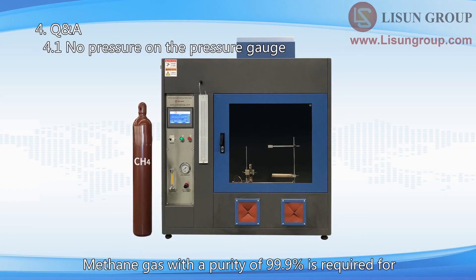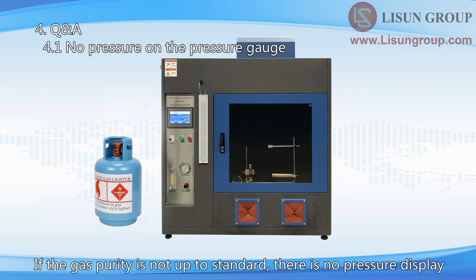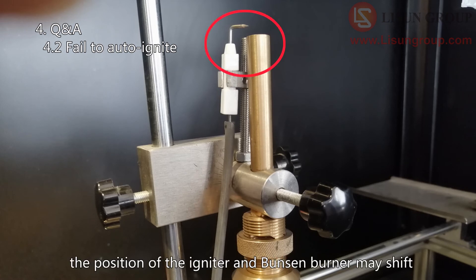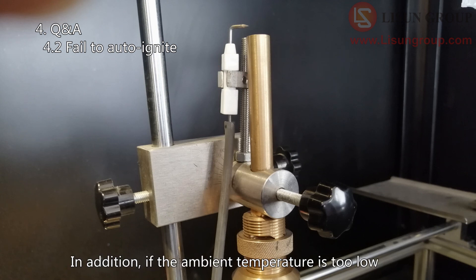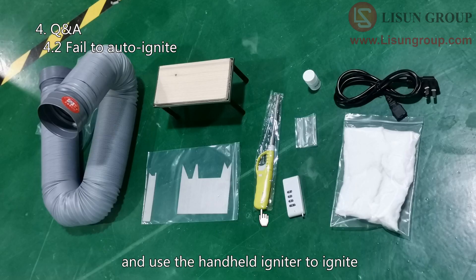Methane gas with a purity of 99.9% is required for horizontal and vertical flame tests according to the standard. Ordinary gas tanks cannot achieve this purity. If the gas purity is not up to standard, there is no pressure display. During transportation of the equipment, the position of the igniter and Bunsen burner may shift. Please fine-tune the position of the igniter and try to ignite again. In addition, if the ambient temperature is too low, the ignition will not be smooth. You can also use the manual test mode and use the handheld igniter to ignite.